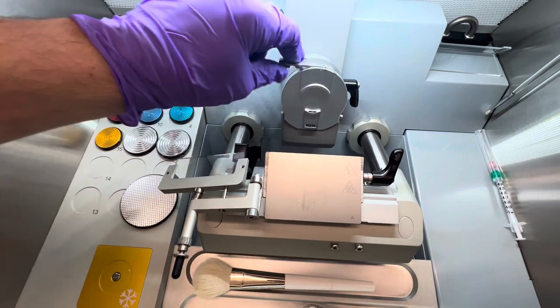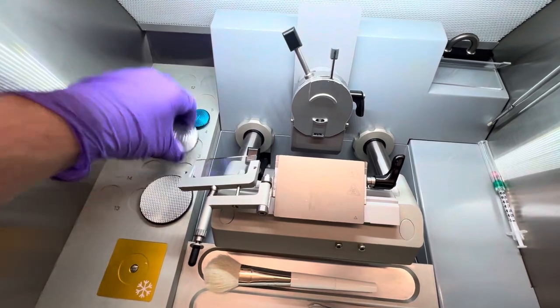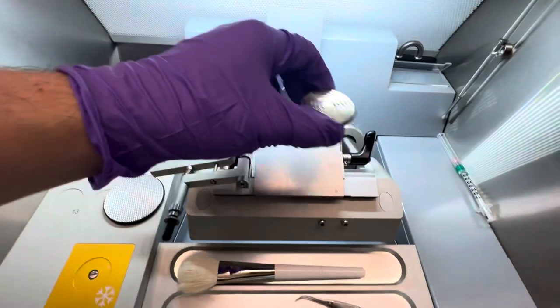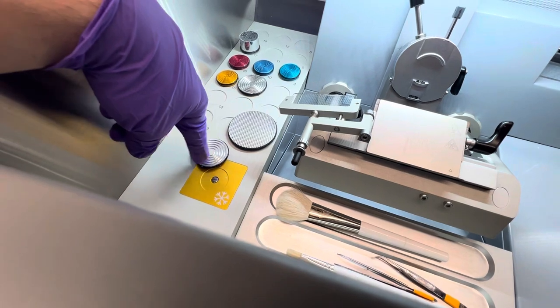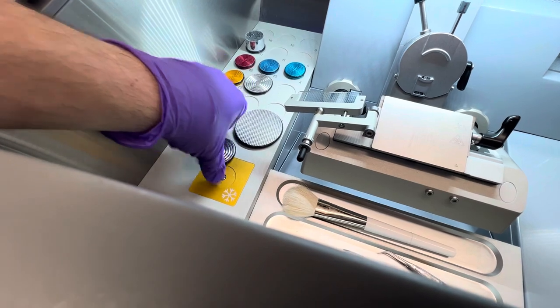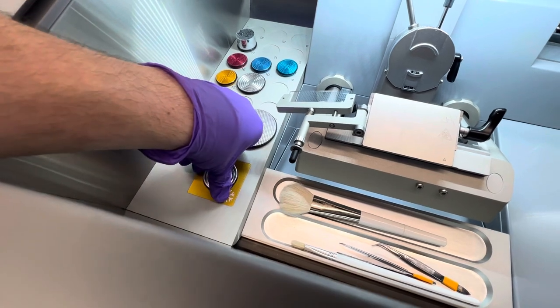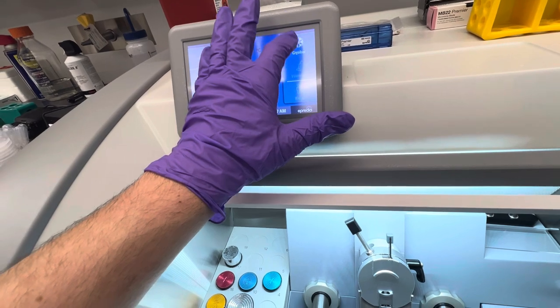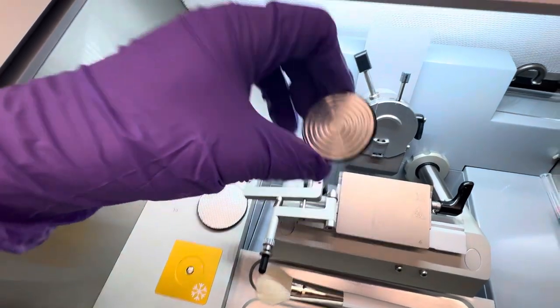This is for clamping down, you can see it there, a chuck. This is a chuck, which is the piece that you'll be setting the block on. As I'll be talking about in the protocol that you'll be reading, I set this down here, you'll be placing OCT onto here and covering this inner area, and you'll be taking a block and pushing it down into there, and then you'll be sitting it onto the cryo bar like this, and it's a circle, so it'll fit right into that area. You'll go up here and turn on the cryo bar, and then turn it off after a few minutes, and it should be frozen, and I have pictures of that in the protocol.